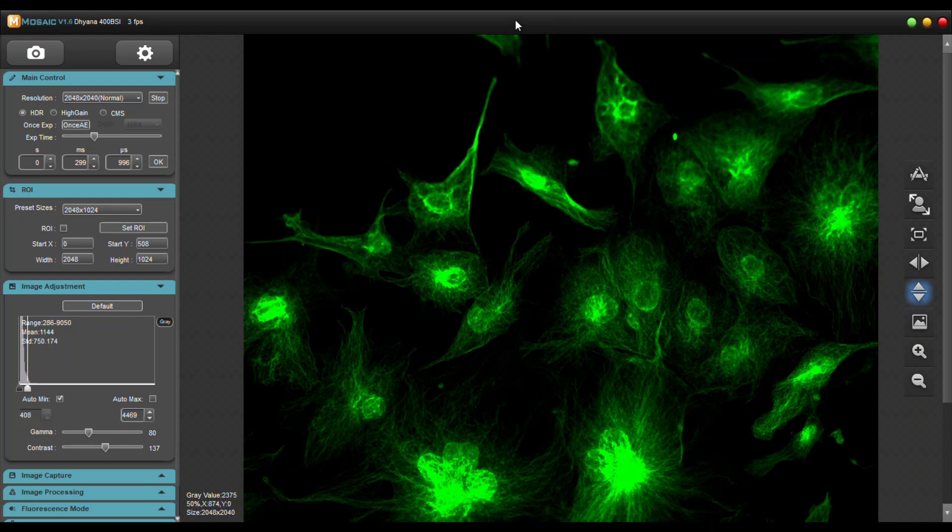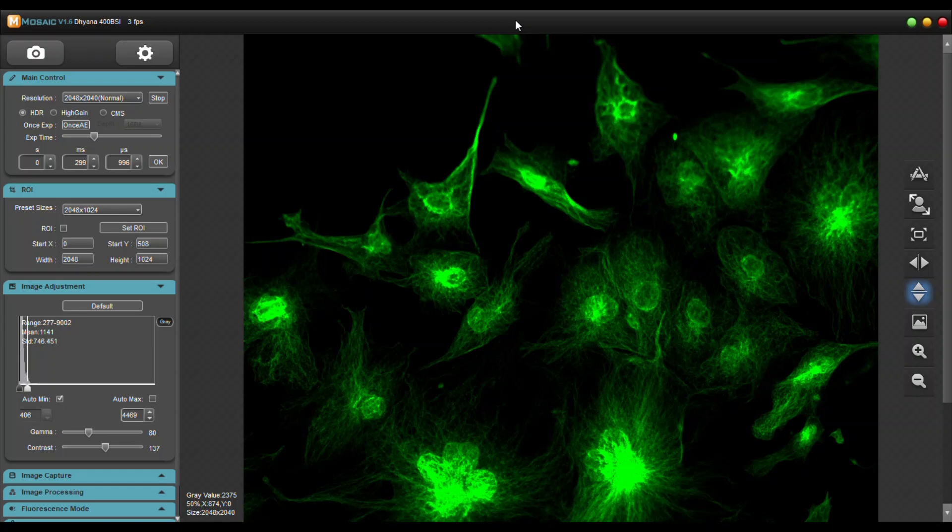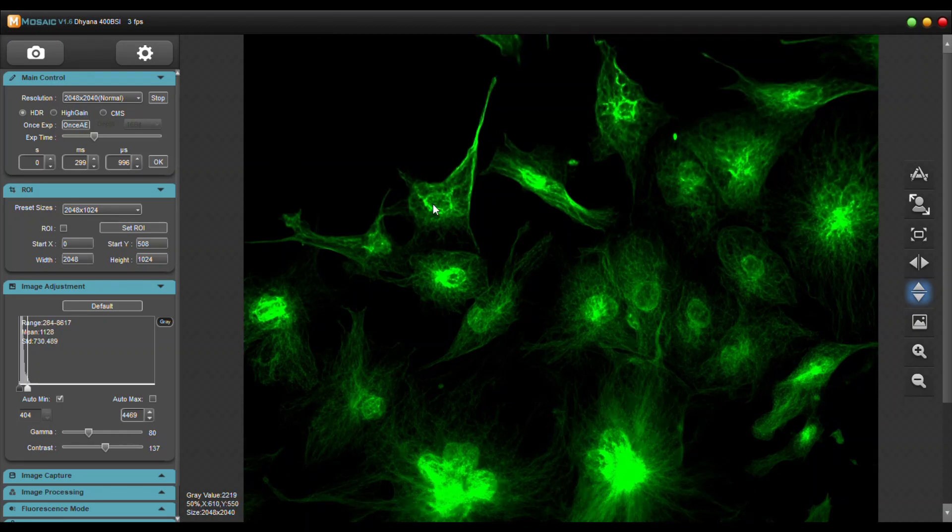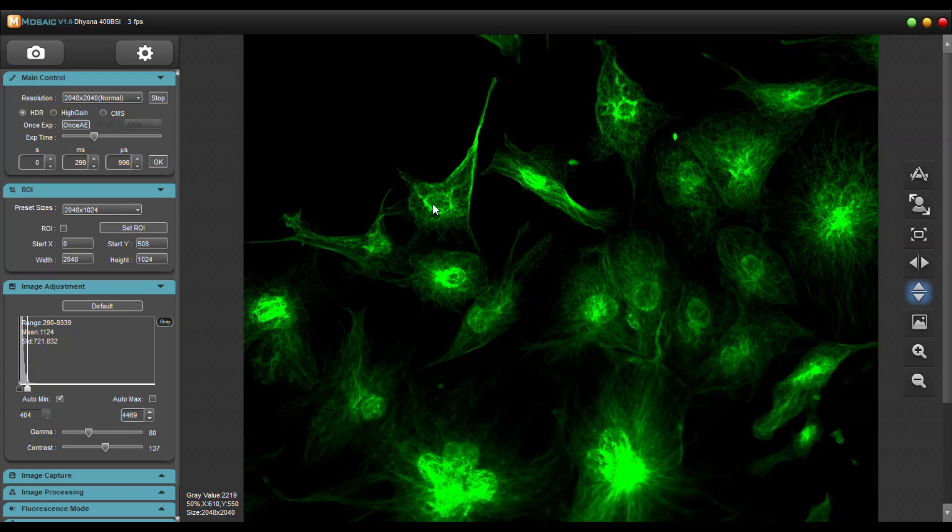I'm actually really impressed with this camera. The thing in the background you're hearing is it actually cooling right now which is a good sound for our cameras. This image itself is very clear, very crisp. You can adjust it. Obviously they're at different depth levels but everything on this looks good.